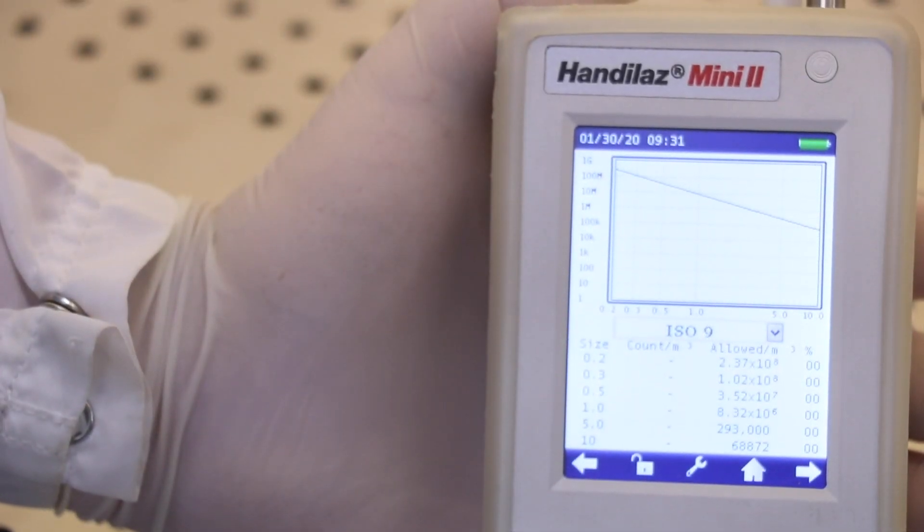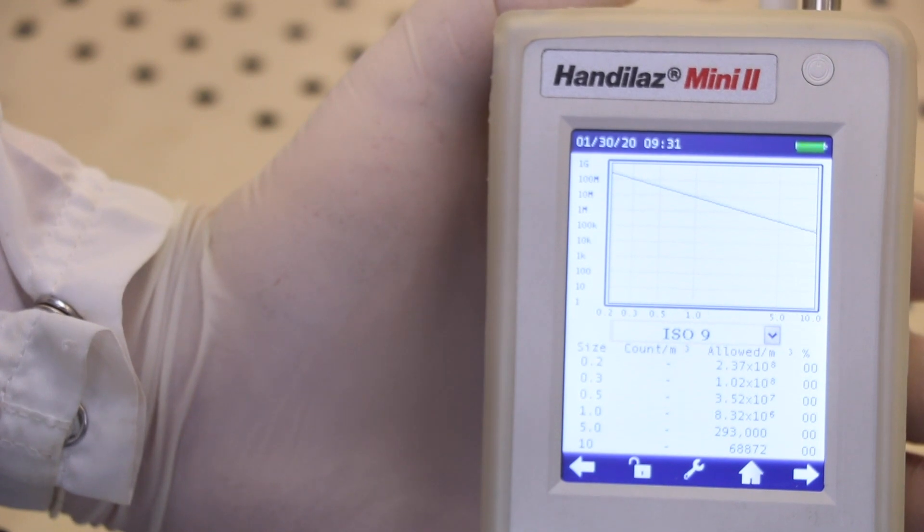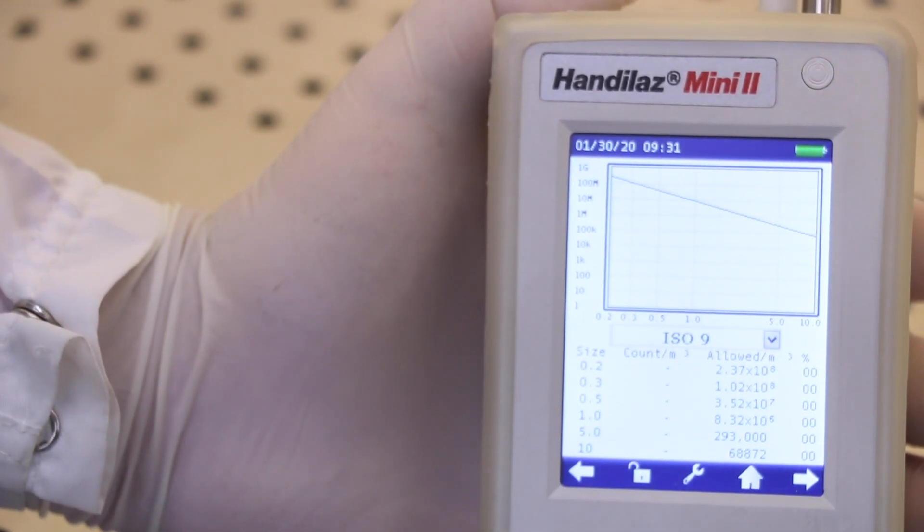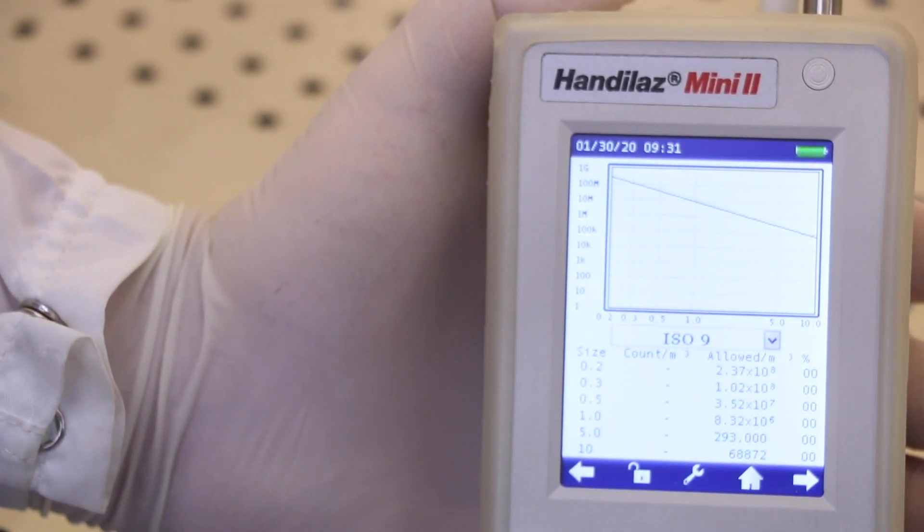One of the many features of the Particle Measuring System's HandyLase Mini 2 is its ability to quickly verify the specification of a clean room or area.